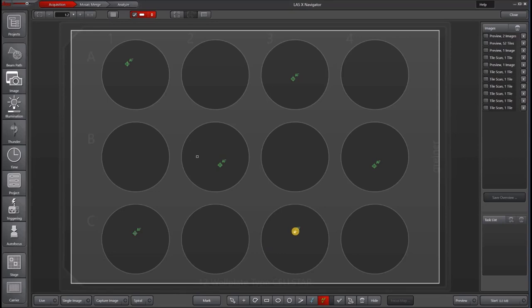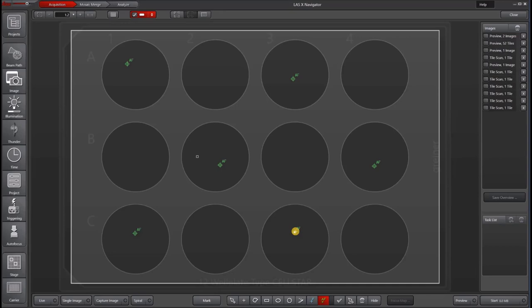Now remember that autofocus isn't like focus map. It will hold the autofocus point or point of focus until it encounters a different autofocus point or command. So unlike the focus map, which intelligently interpolates focus between focus map points, it is much more one-dimensional. I would use it for these individual points or smaller areas, such as in well plate experiments. If you are doing a tile scan or mosaic, then I would use the focus map for that. Please see the focus map tutorial for instructions on how to set up a focus map.